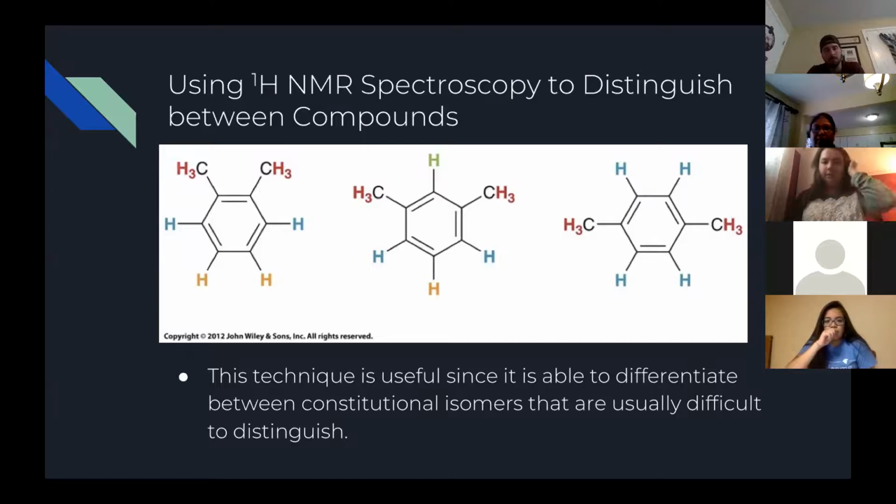Are you talking about splitting with? Yeah, because they have neighbors on both sides. You'll not see a whole lot of these, but you could. But definitely, I know some of your unknown compounds have patterns like that.